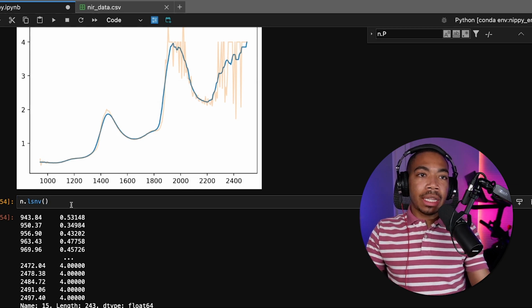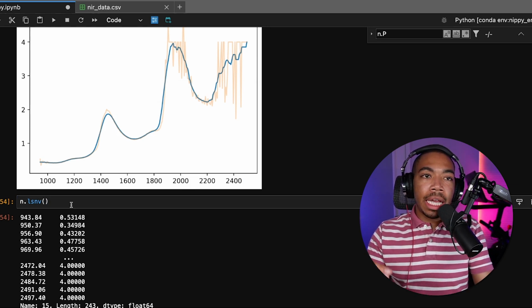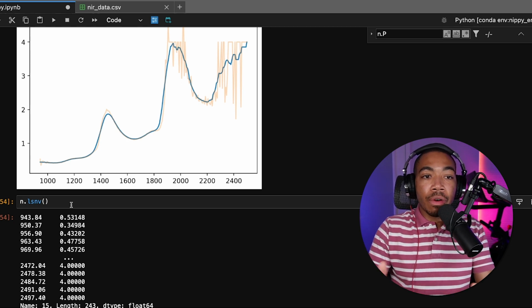I haven't checked the accuracy of these algorithms, but if you want to go through and look at the documentation, feel free. I think this was a great exploration.